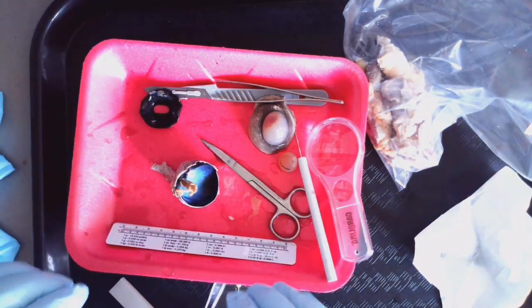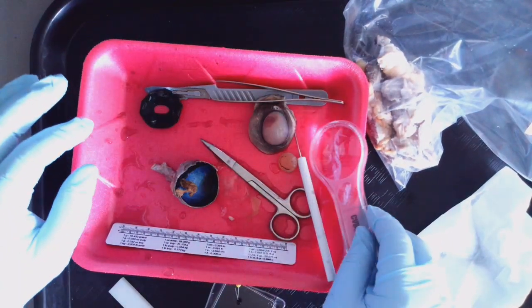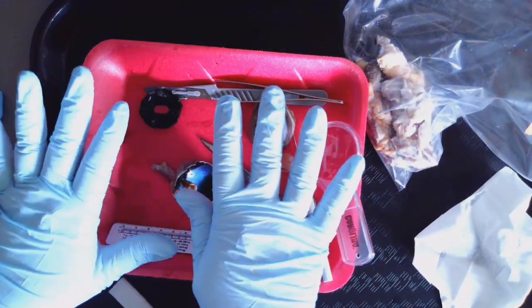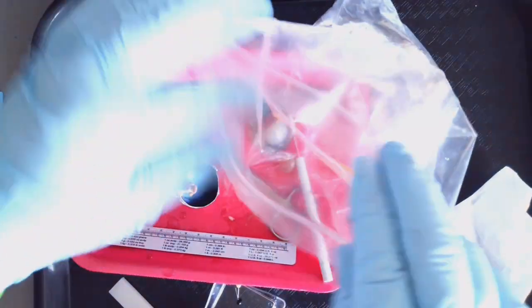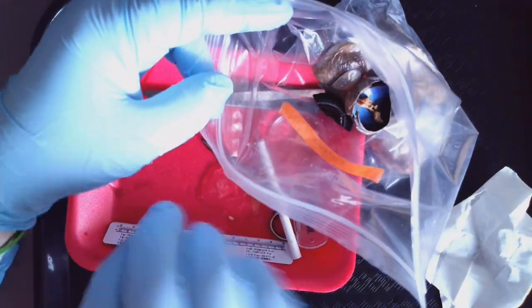So now I'm ready for cleanup. I have examined anything that I possibly wanted to. All of my tools that I used are sitting on this tray. Now, what I'm going to do is take this bag that had the tissue, and I'm going to put all of the pieces of the eye in there.